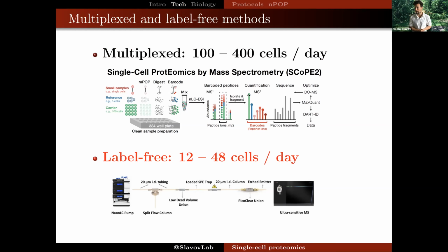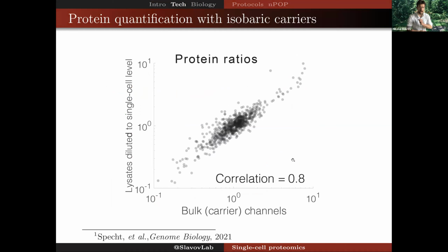And there have been many versions of this approach. You're going to hear in the next month's webinar from Matthias Mann about a particular label-free approach that his lab has developed. And because in this case you're not barcoding the cells, the throughput is generally lower. If those methods are applied correctly with the required benchmarks, one can obtain fairly quantitative data.